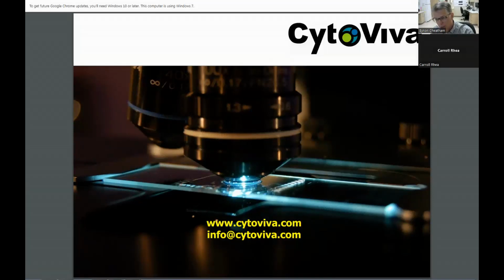And Dr. Chithrani, who I mentioned earlier at University of Victoria, was able to demonstrate that when a nanoparticle was inside a cell and it crossed the nuclear membrane, there was again a change in the biocorona of that nanoparticle in the nucleus versus outside of the nucleus that resulted in a shift in the spectrum. This is very detailed work, conducted over not days and probably not months, but years. But that sort of ability is there with the system. Honestly, the easiest way is if you have the 3D capability with the CytoViva system, and you could do 3D imaging to know where nanoparticles are in the X, the Y, and the Z.